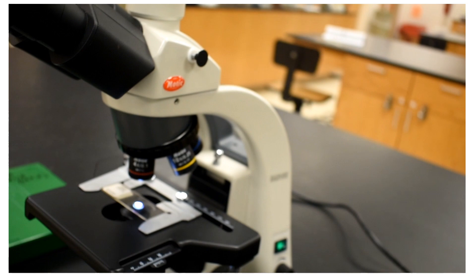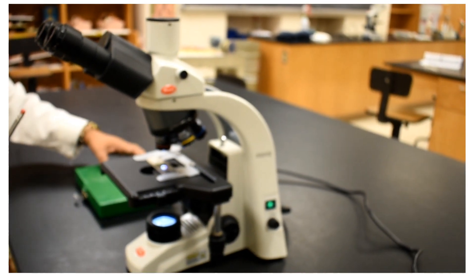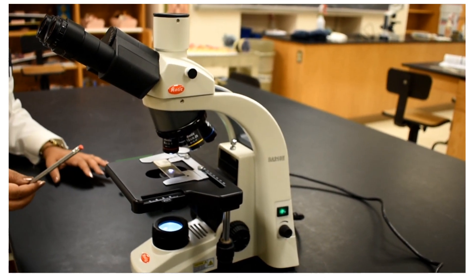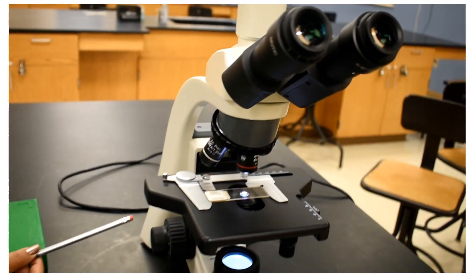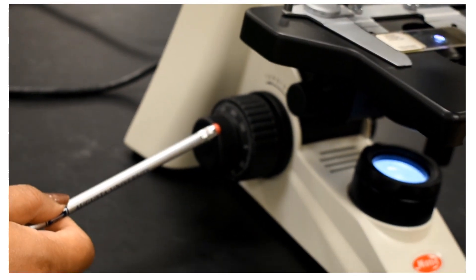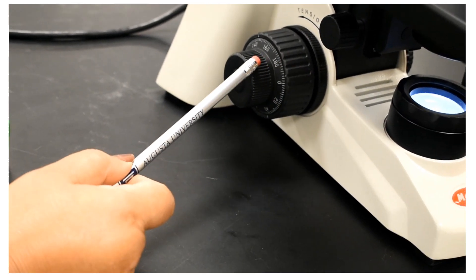Those are all the different parts of the microscope. Coming to the other side of the microscope, you will be able to see the size difference between the coarse adjustment and the fine adjustment knobs distinctly.